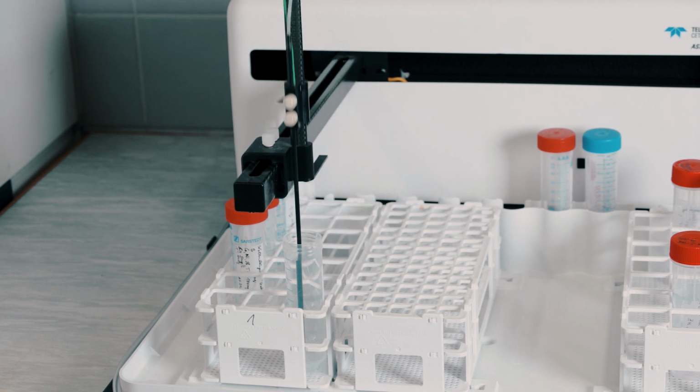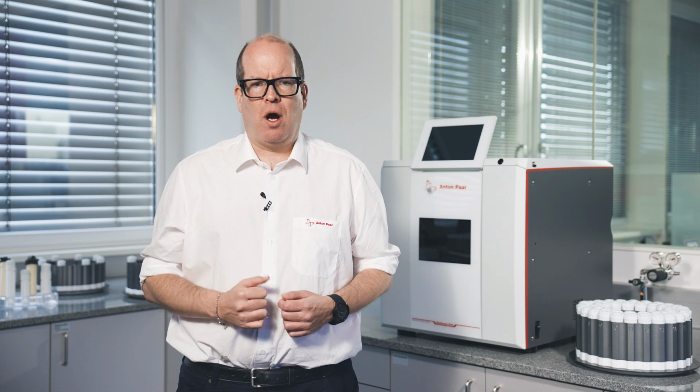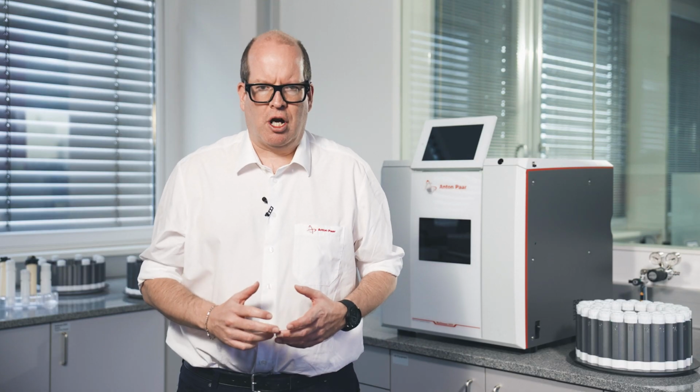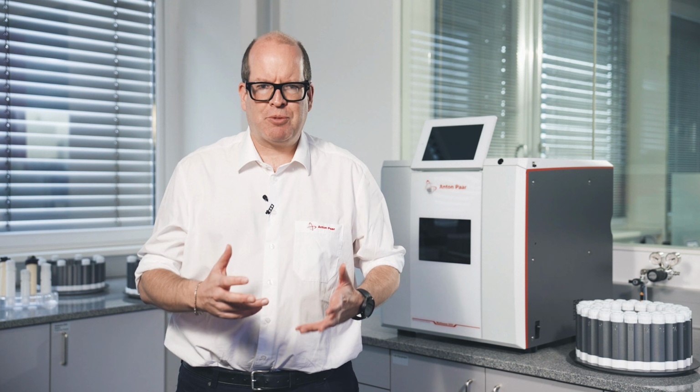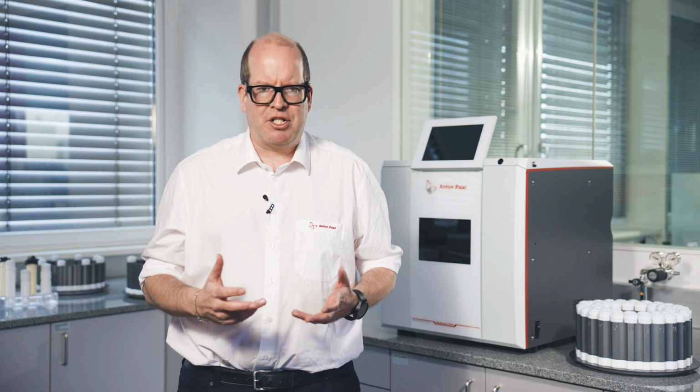Regarding the required amount of digestion solution for analysis, it should be noted that flame atomic absorption spectrometry, in short FAAS, requires a lot of solution. For successful analysis of one element only, you will already need several milliliters. This means that for a broad element spectrum, it could be tight with a classic acid digestion recipe. In contrast, for graphite furnace atomic absorption spectrometry, several microliters of digestion solution are enough, which allows for acid digestion on a smaller scale.